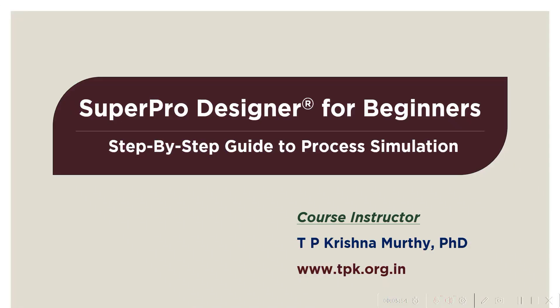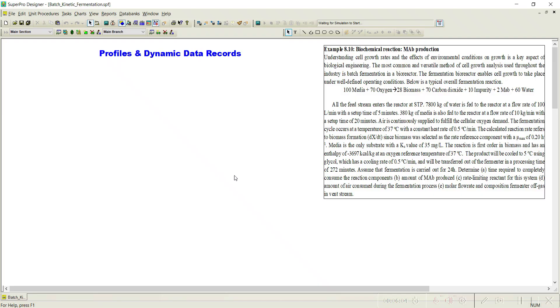Namaste, welcome to this tutorial series on SuperPro Designer for beginners — a step-by-step guide to process simulation. In this tutorial, let us understand some interesting features available in SuperPro Designer, that is profiles and dynamic data records.